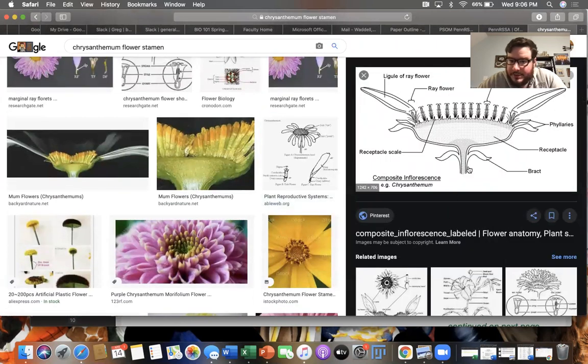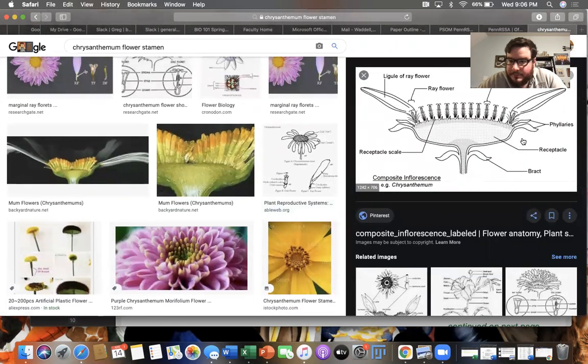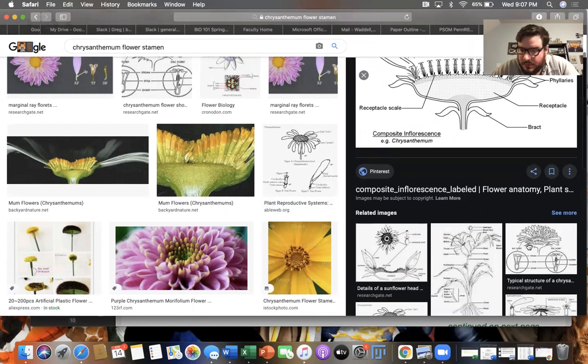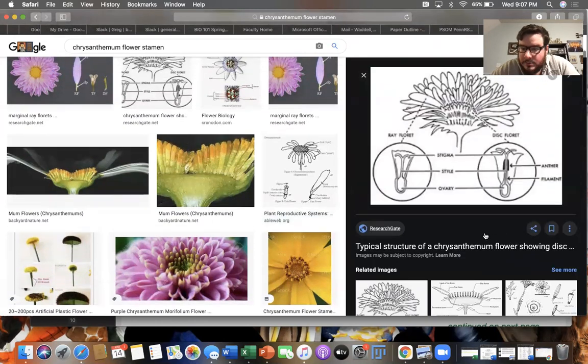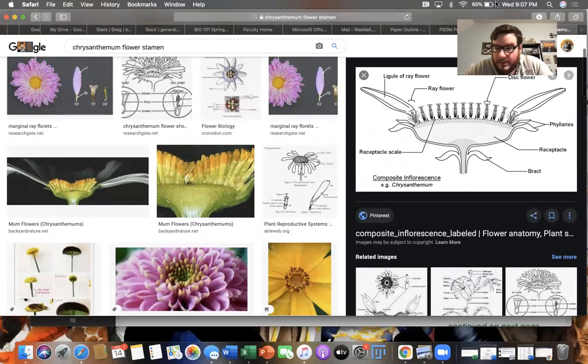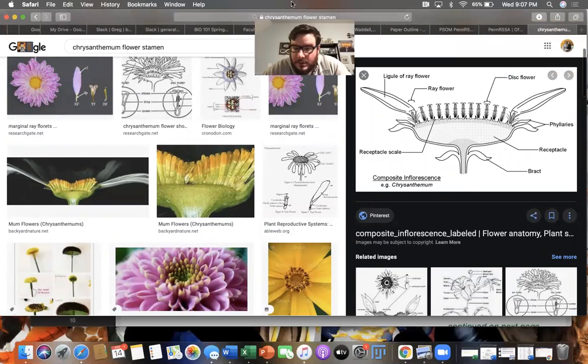There we go. Chrysanthemum. Receptacle, ray, petals. It's not really. Oh, okay. Interesting. All right.